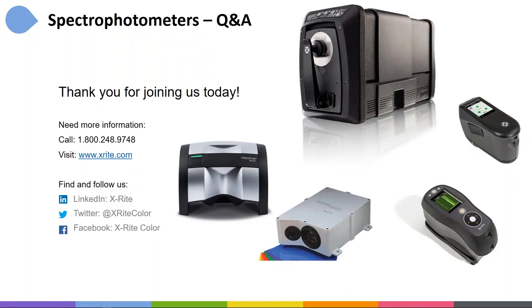So you'll always have something like D65. That D65 is the illuminant. That would be a mathematical representation of a light source. So it's mathematically mimicking daylight. So that's what the D65 means. The /10 means it's using the 10-degree observer values. That's a test that was done to account for human vision. So D65/10 is accounting for the light source and the human part in the calculations.